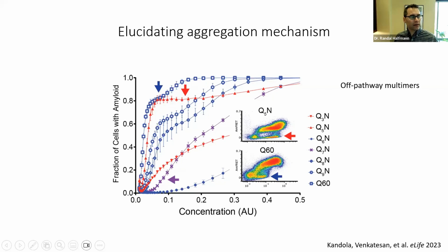is that for most of these proteins, there's multiple parts of the curve. So in this case for polyQ, initially your amyloid forming population increases dramatically up until a point, and there's a plateau or a shoulder where you have a regime where amyloid formation is no longer responding to concentration. That is to say that high concentrations are actually blocking amyloid formation. And then there's a second regime here where you now have hypothetically a different kind of aggregated state that's now increasing.